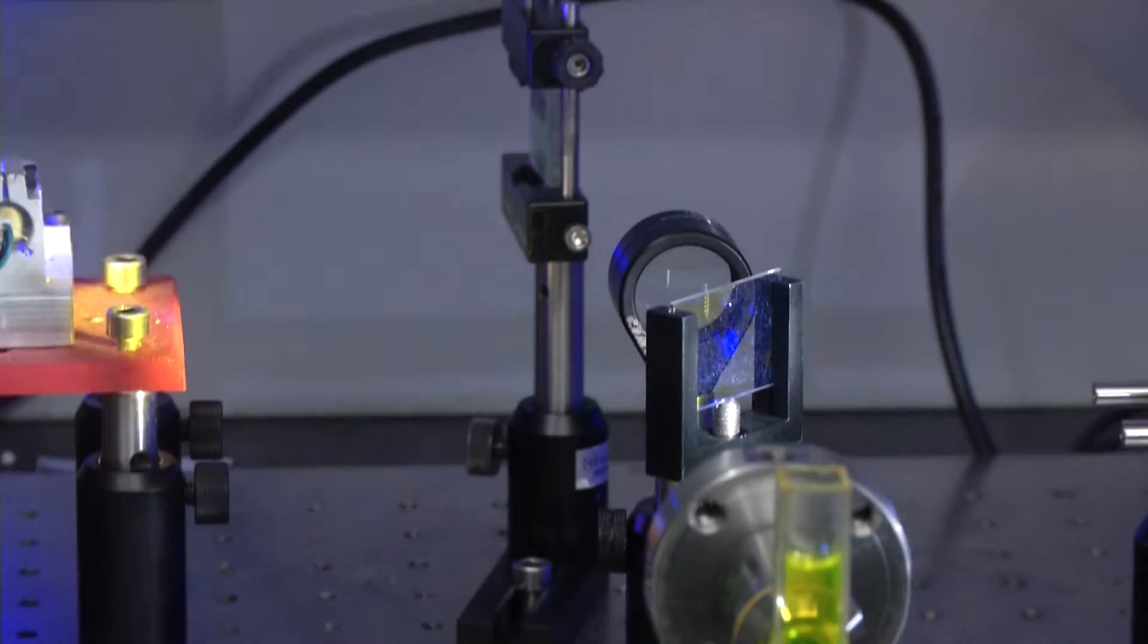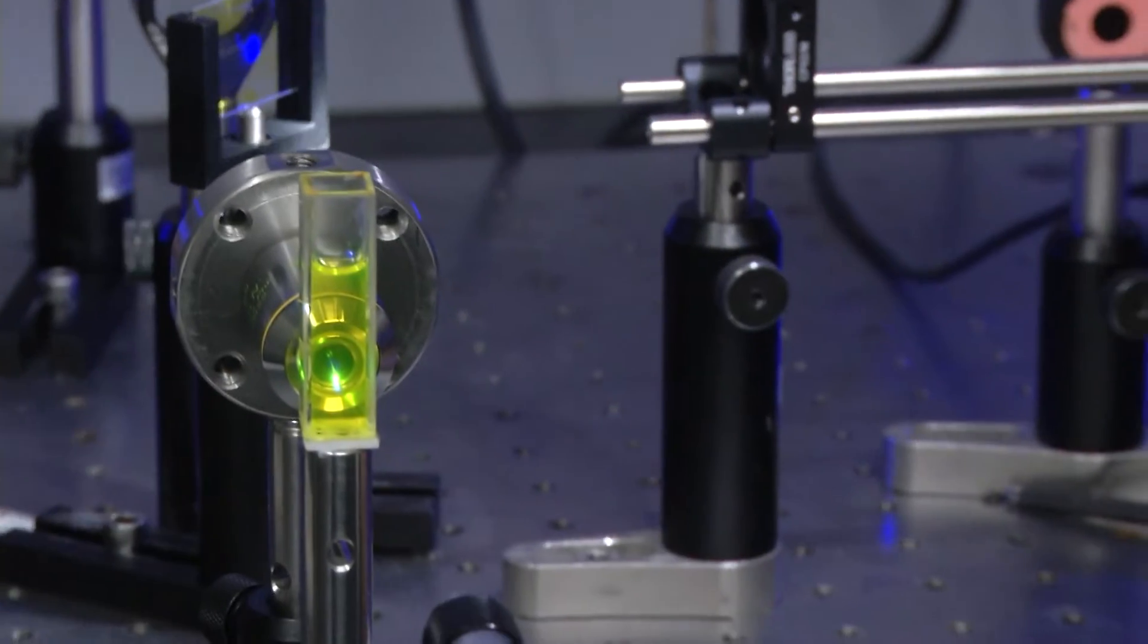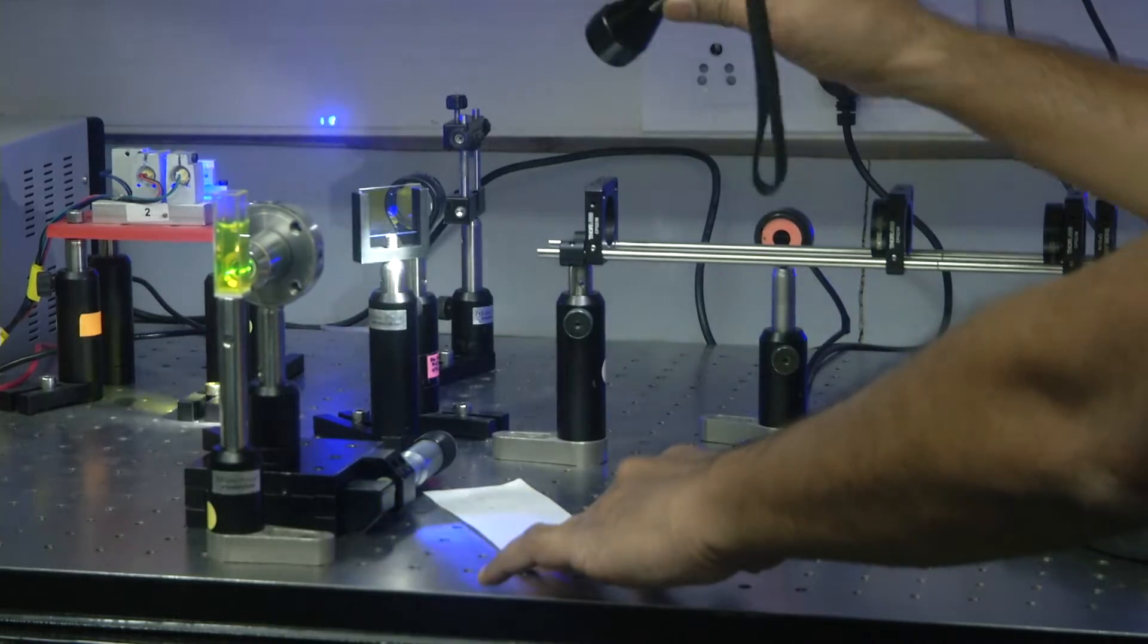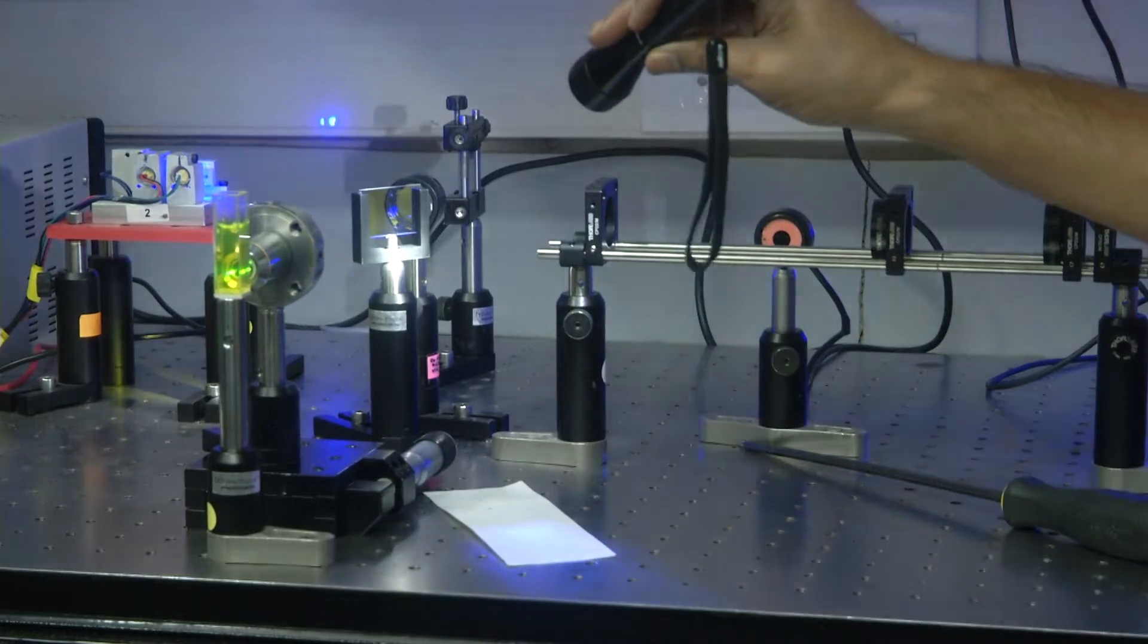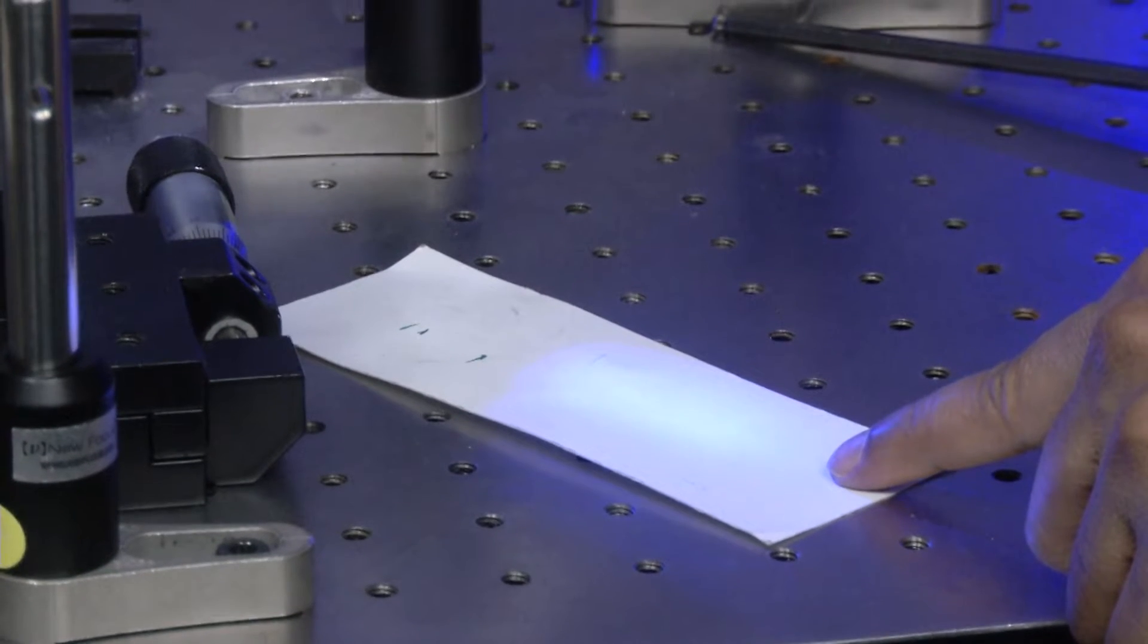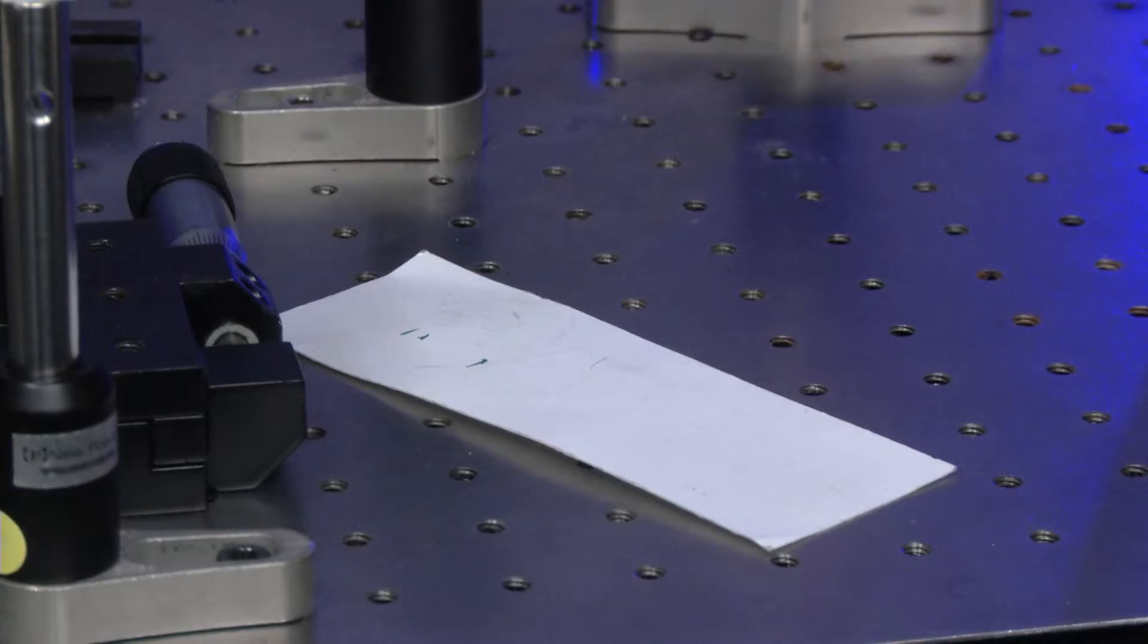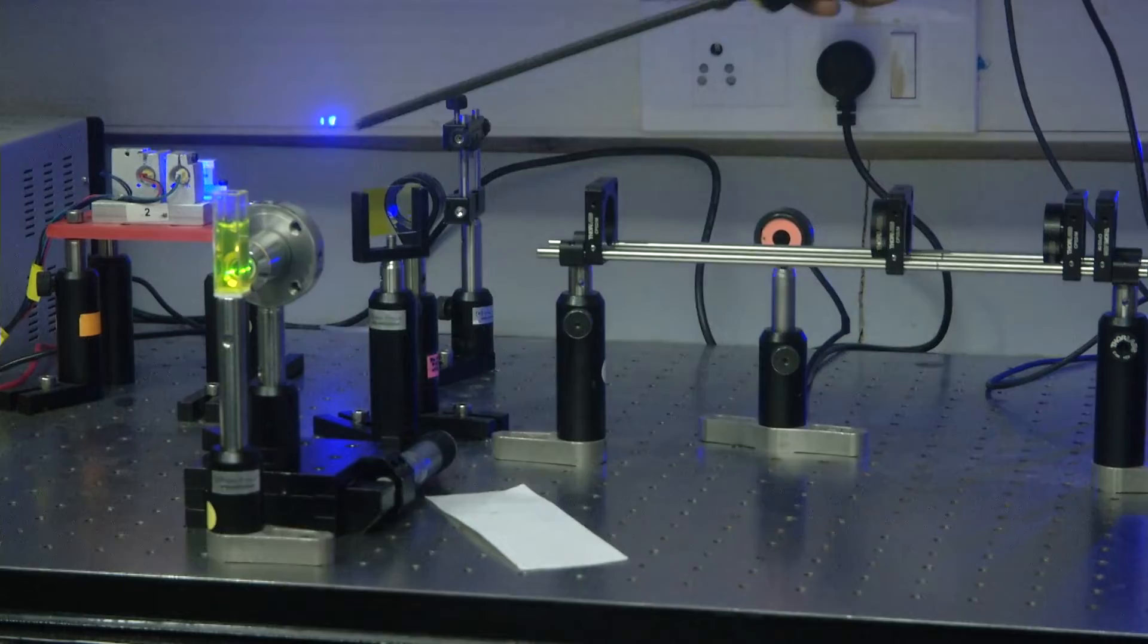On the other hand, if you actually look at the reflection, now you can take a look at the blue light on the card here. Now the reflection is blue. This is exactly what we want. We actually want the blue excitation light to be reflected onto this pathway while the fluorescence, the yellow-green fluorescence, to be transmitted.